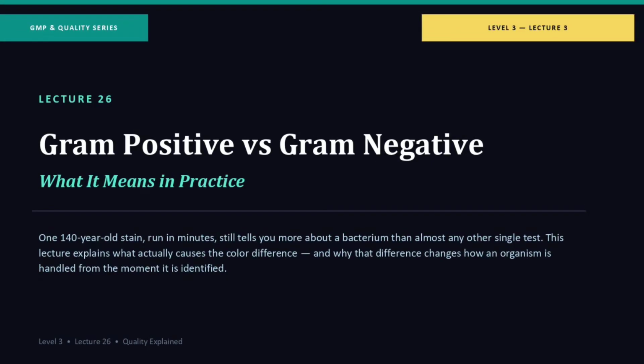Welcome back. This is Lecture 26, Gram-positive versus Gram-negative, what it means in practice. Last lecture, we touched briefly on the bacterial cell wall and mentioned that it is exactly what the Gram stain reacts to. Today we go deep on that single test.